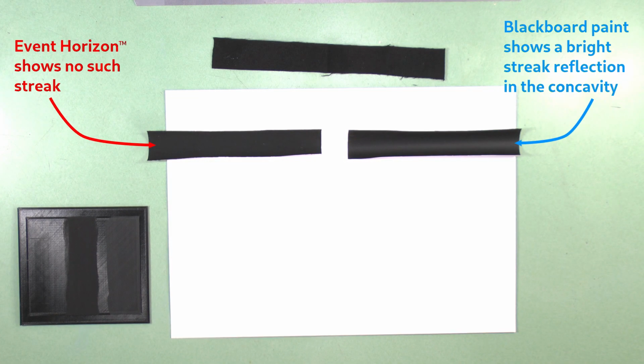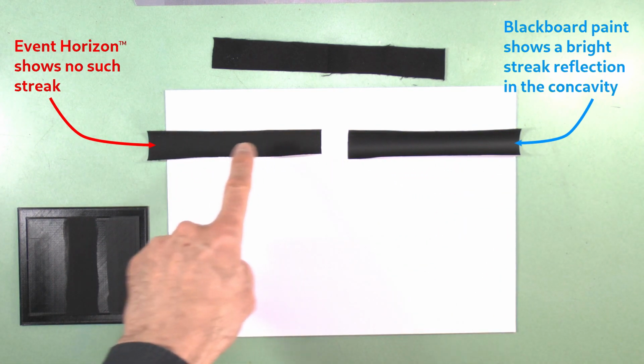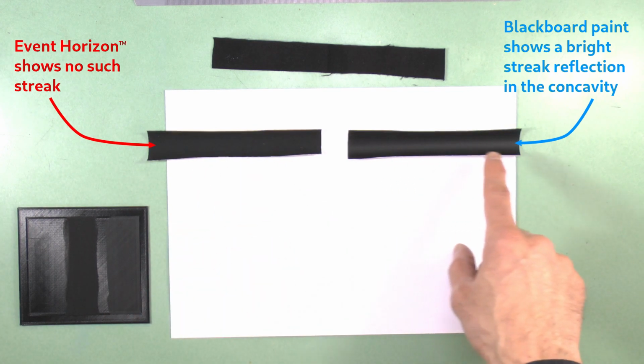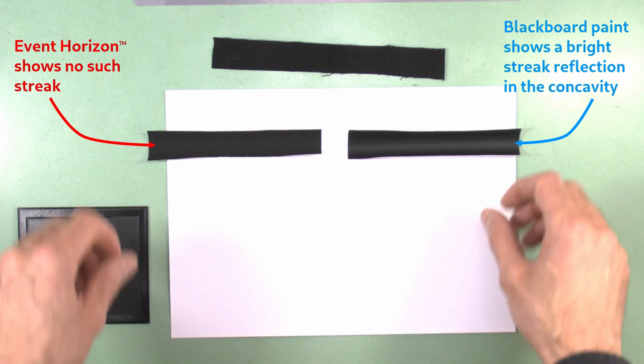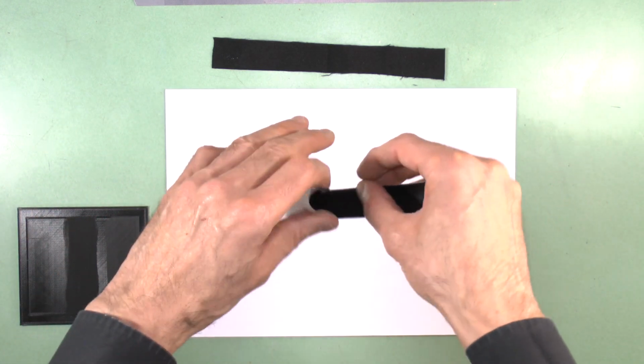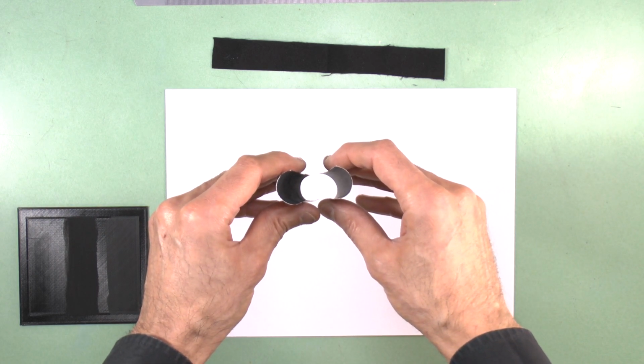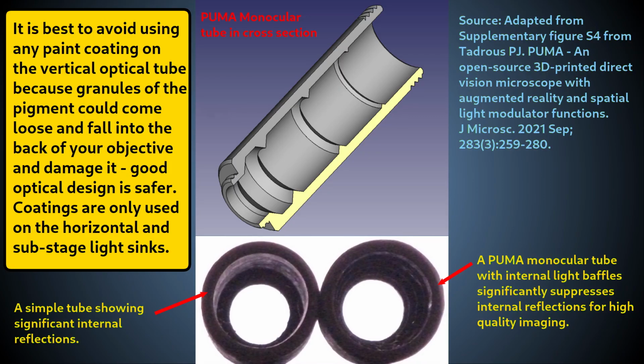You can see in this comparison that Event Horizon shows less reflection on the concavity of the partial tubes compared to the blackboard paint. Also, note the superior matte black effect of Event Horizon for very oblique illumination, something that is important for use in optical tubes, although PUMA does not use paint or flocking in its optical tube because the light baffles in the tube prevent internal reflections by design.